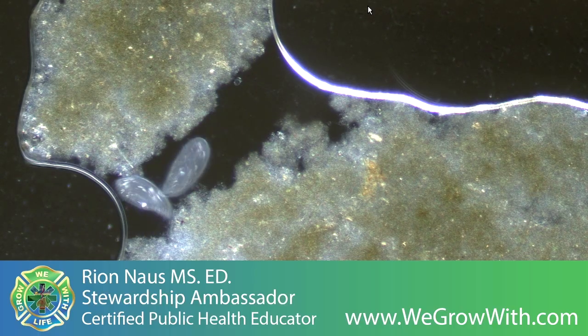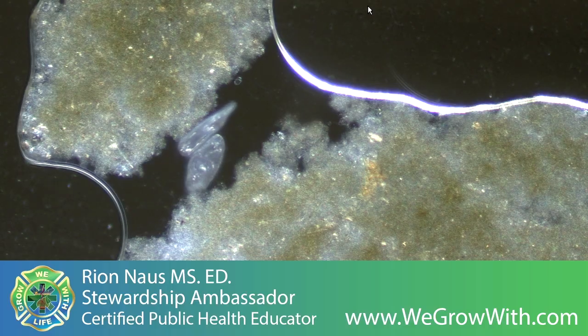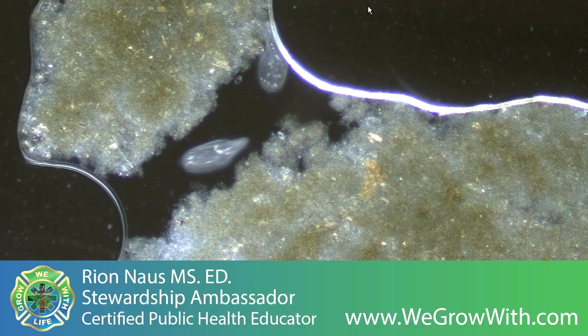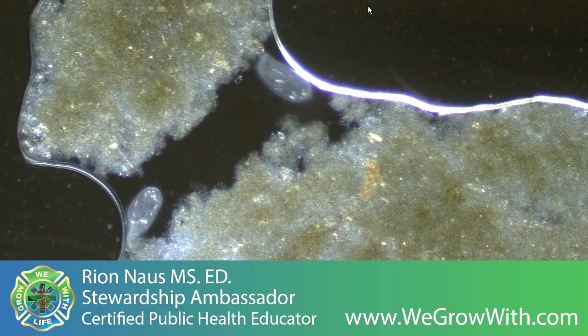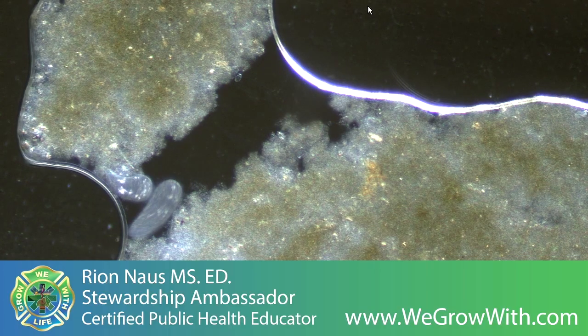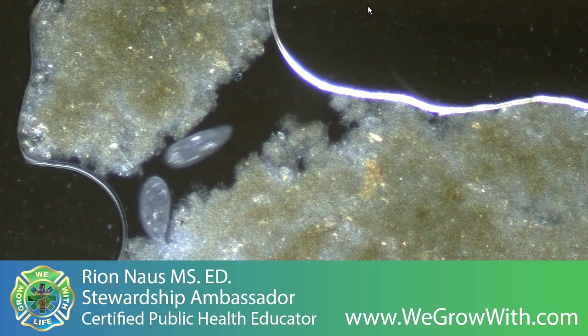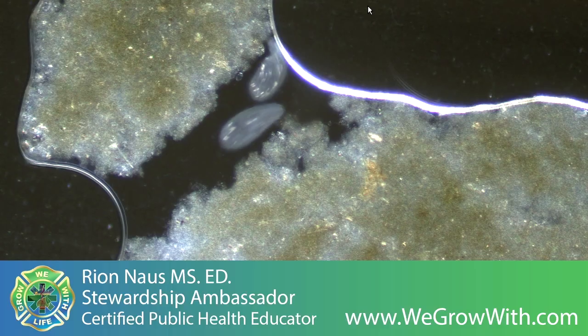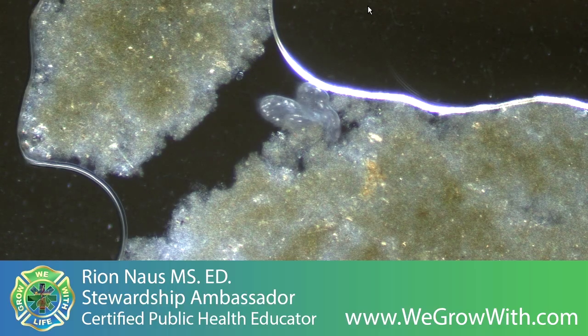Now, this small end of this larger aggregate, the whole slide is drying. And so it's not just the water. So there's a drawing of all those pieces together until they're too big.